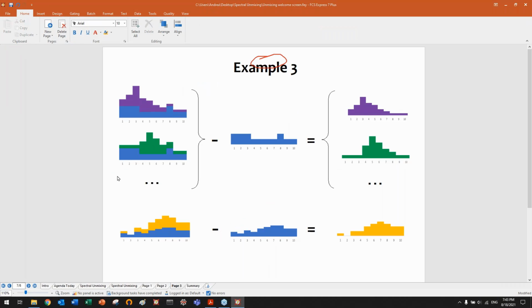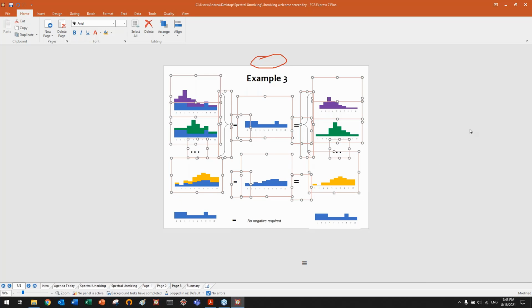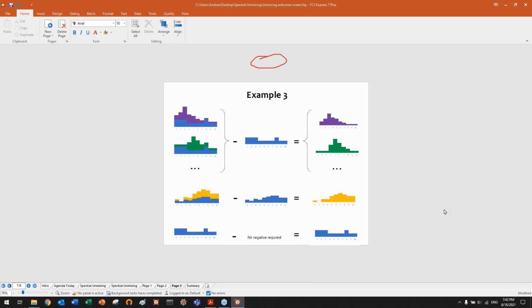Now we are on this other example, in which we are not only extracting pure signatures from fluorochromes, from dyes. We also want to be able to measure the autofluorescence of one or multiple populations.